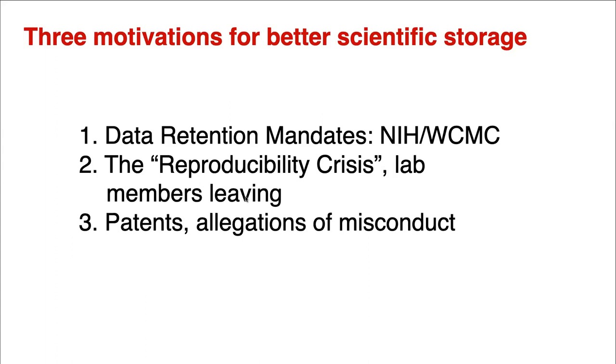And so if you have everything in LabArchive, everything that one of the members has done stays with the PI. The PI can actually give access to the person who is leaving if they need to finish a paper, need to finish a manuscript, and they can look at the LabArchive notebook for free from any email, either from the institution that they're going to, but also from a regular Gmail access.